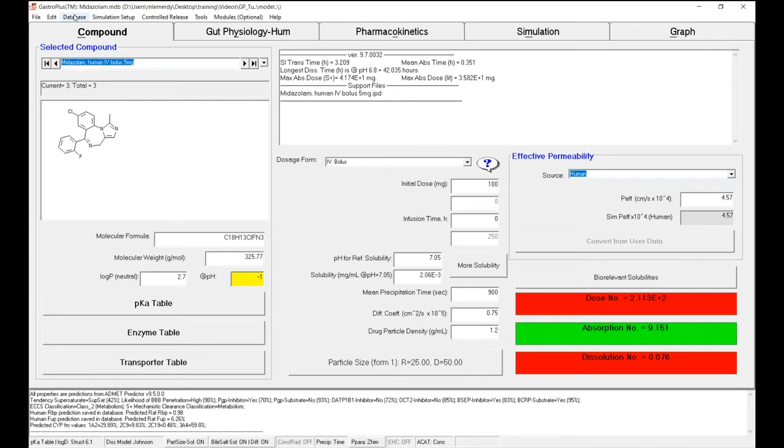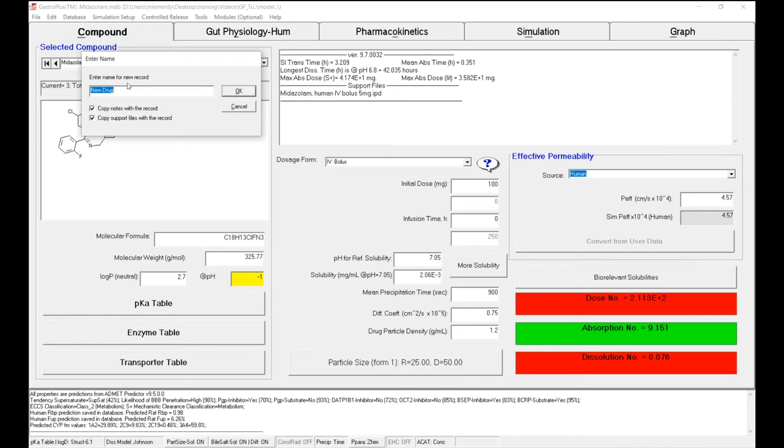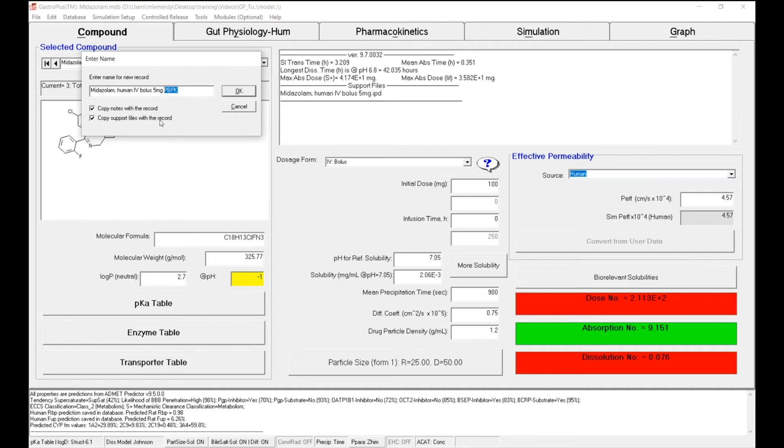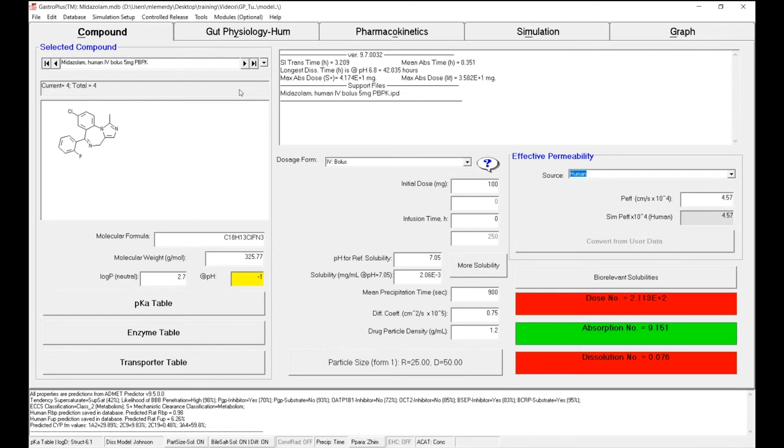I will simply copy this name and create a new record. So I can go to database, copy the record, and name it midazolam human IV bolus 5 milligrams, and this time put in the name PBPK model. I also want to copy the support files with the record because I will want to describe them with this new model. And I can click on OK. I have now this new record that I will use to describe my IV data with my PBPK model.